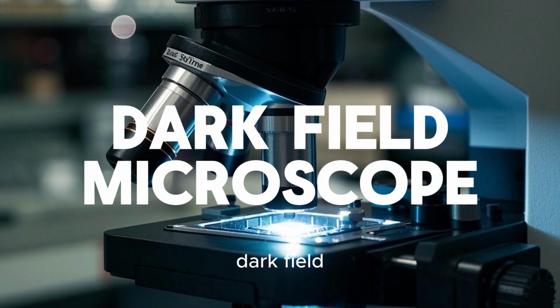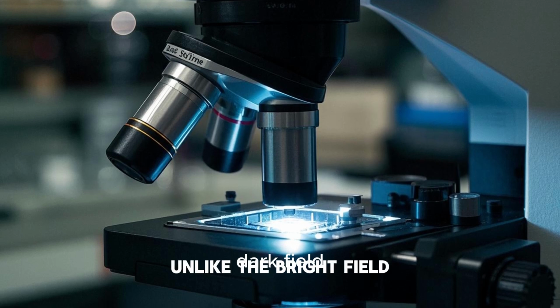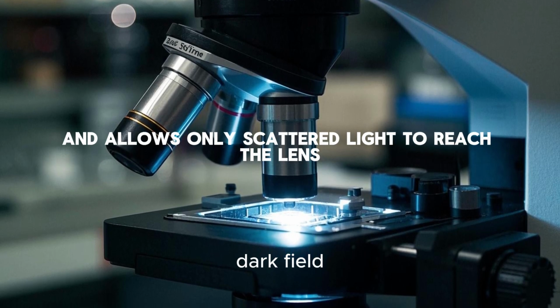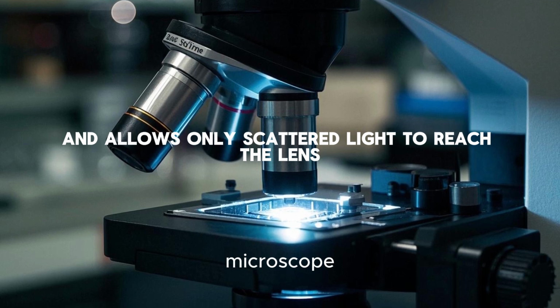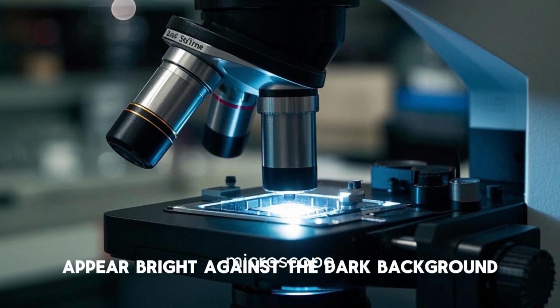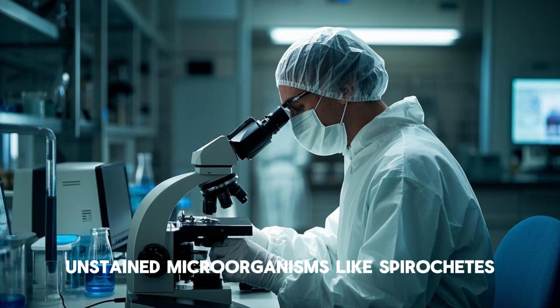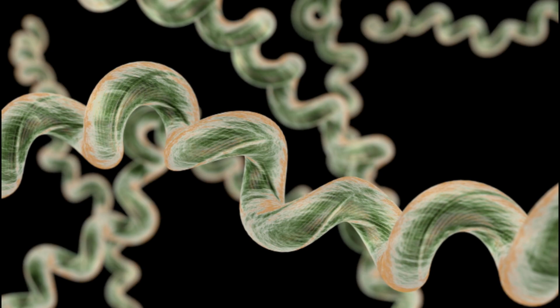Next up, the dark field microscope. Unlike the bright field, this uses a special condenser that blocks direct light and allows only scattered light to reach the lens. This makes the specimen appear bright against a dark background, ideal for observing live, unstained microorganisms like spirochetes.